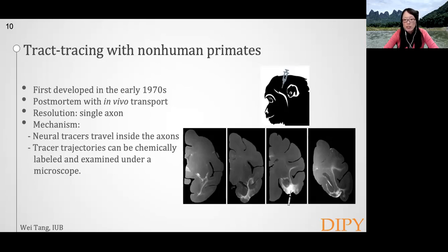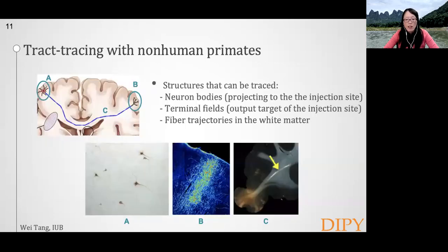By going through the stained brain slices one after the other under the microscope, one can reconstruct the full details of the fiber pathway being studied. Thus, tract tracing is a highly precise and highly sensitive method to study brain connectivity at a single axon level. There are 3 types of labeling in tract tracing that are most important for inferring brain connections.